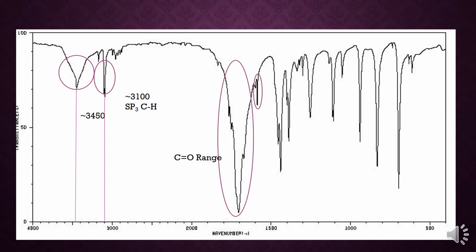Now if you look here at this small little jutlet, notice that this sticks out just past that into our C-O and aromatics range, or zone 5. What this means is that we might have one of our oxygens either single bonded to a carbon, or it's possible that we have an aromatic ring somewhere within our structure.